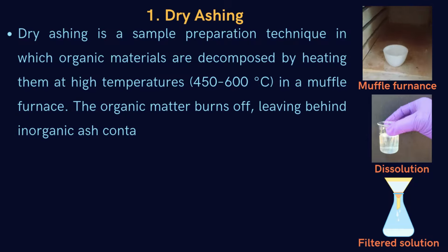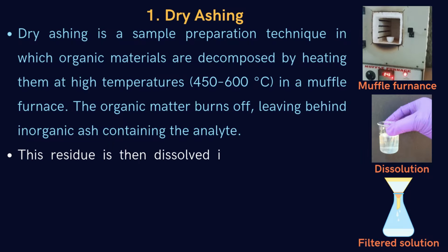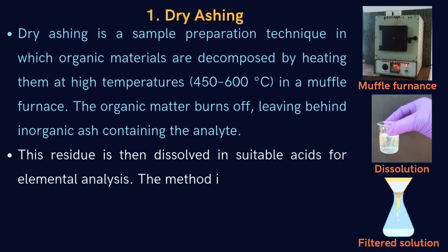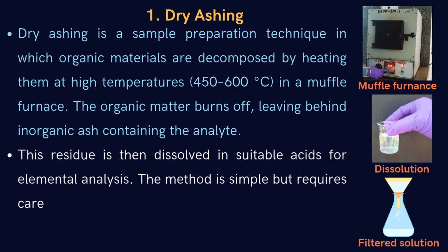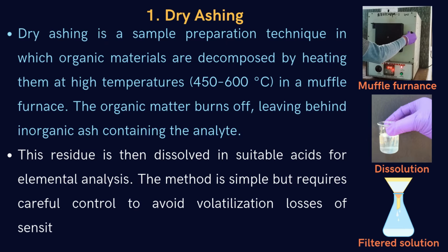The organic matter burns off, leaving behind inorganic ash containing the analyte. This residue is then dissolved in suitable acids for elemental analysis. The method is simple but requires careful control to avoid volatilization losses of sensitive elements.